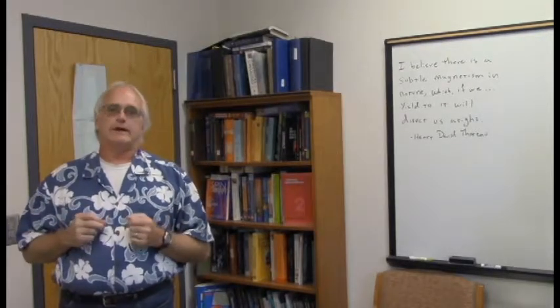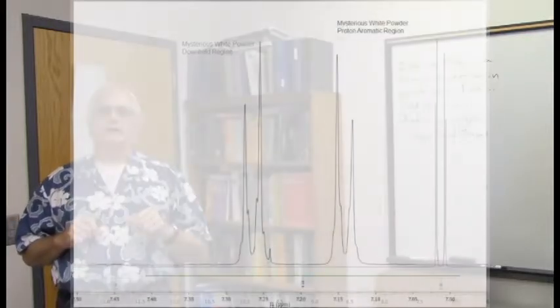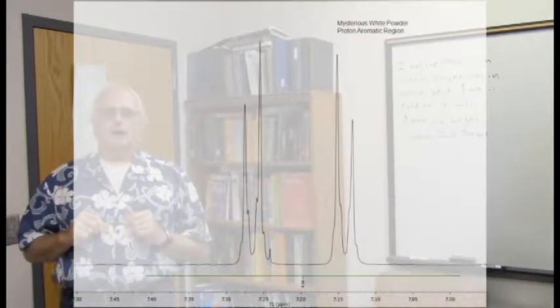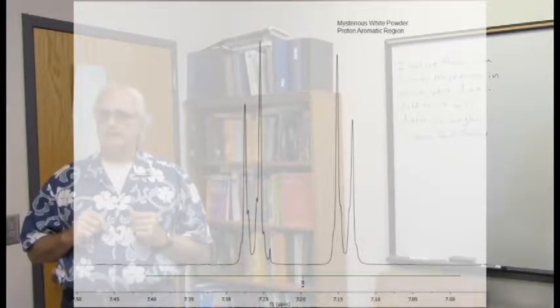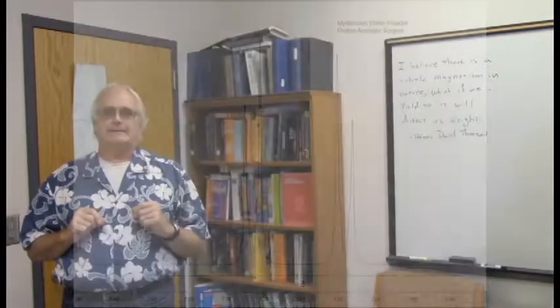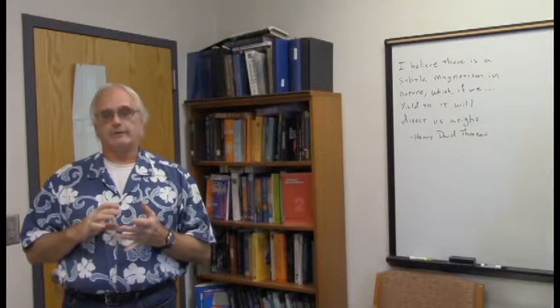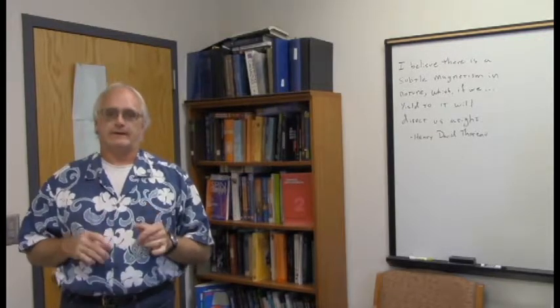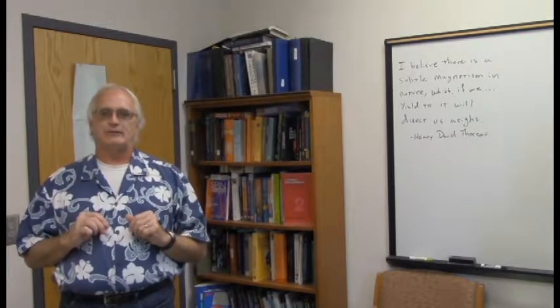We also see a very nice aromatic region right here in the classic aromatic region between 7 and 7.5 ppm in the proton spectrum. And in fact, it's a lovely area. It integrates 2 and 2, 4 total, indicating that it's almost certainly a di-substituted benzene ring. The symmetry of it leads one to think, in a di-substituted case, ortho, meta, or para. Para is the most symmetric, and the proton spectrum is nice and symmetric. So it makes us think about that.